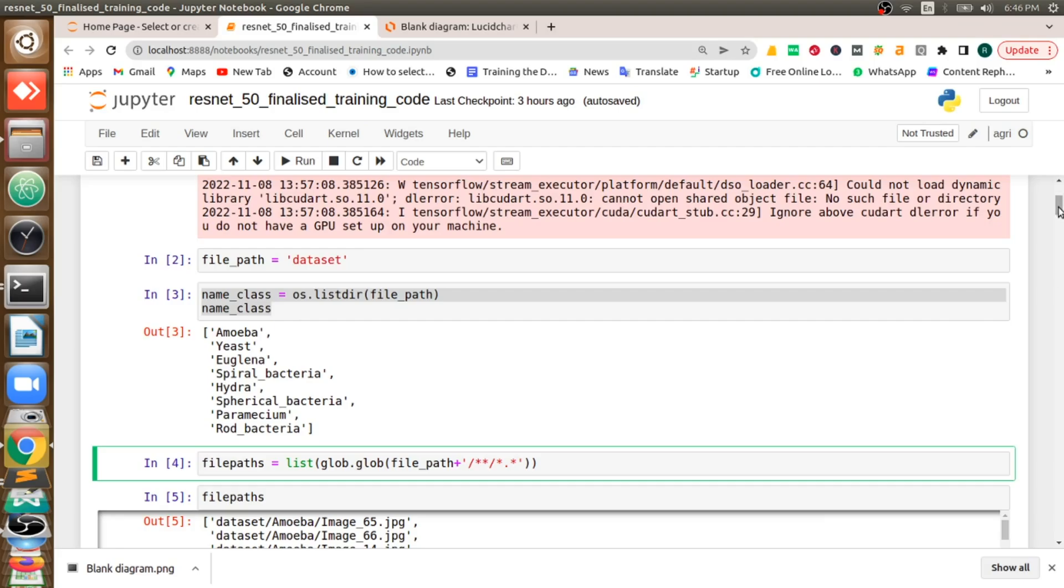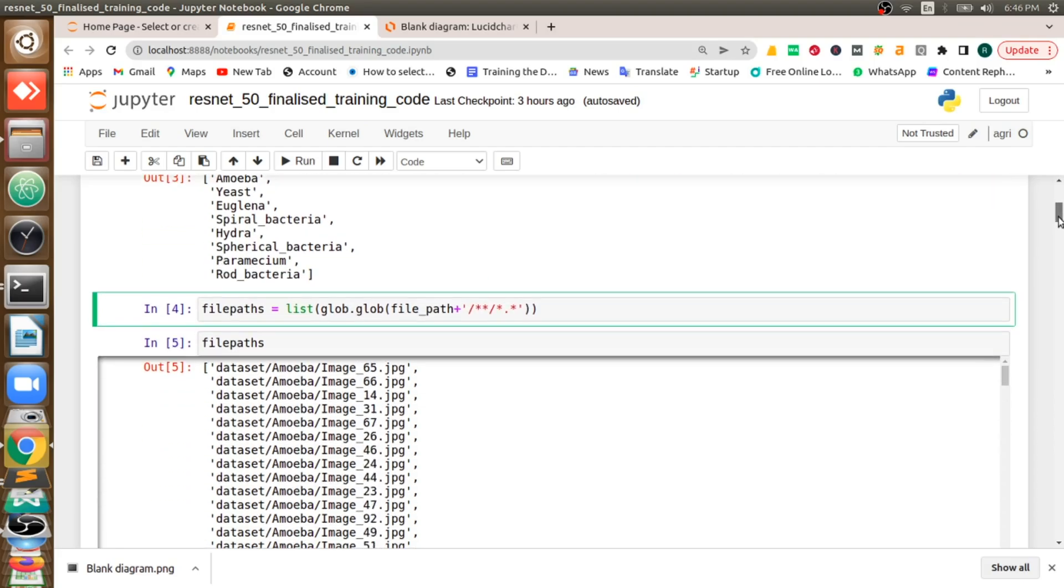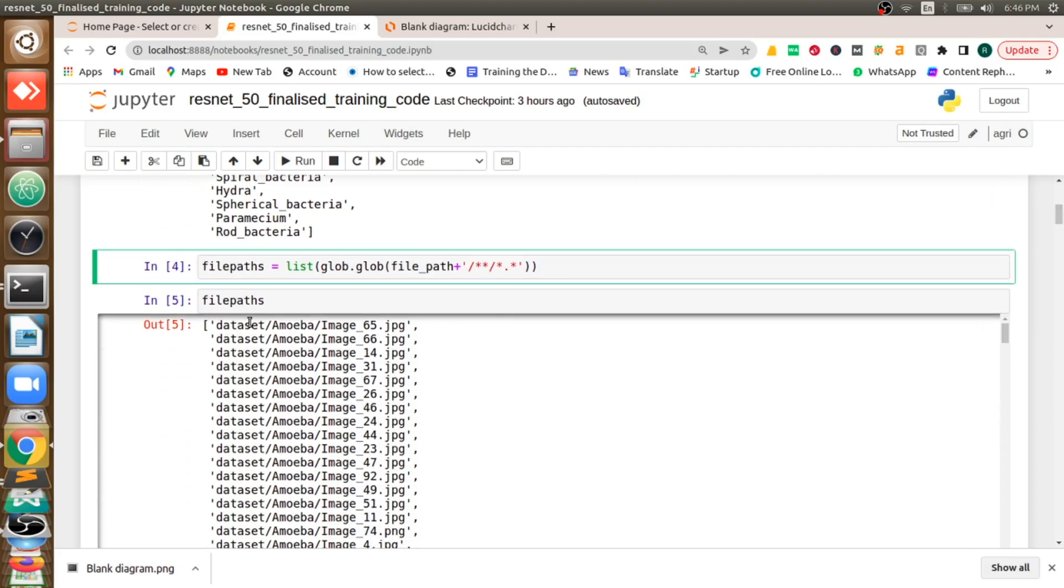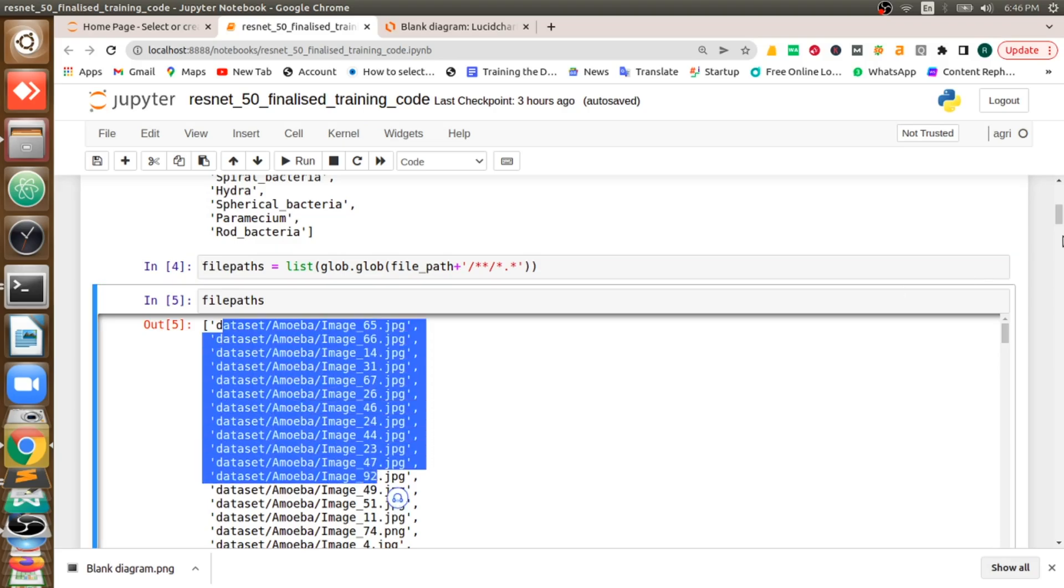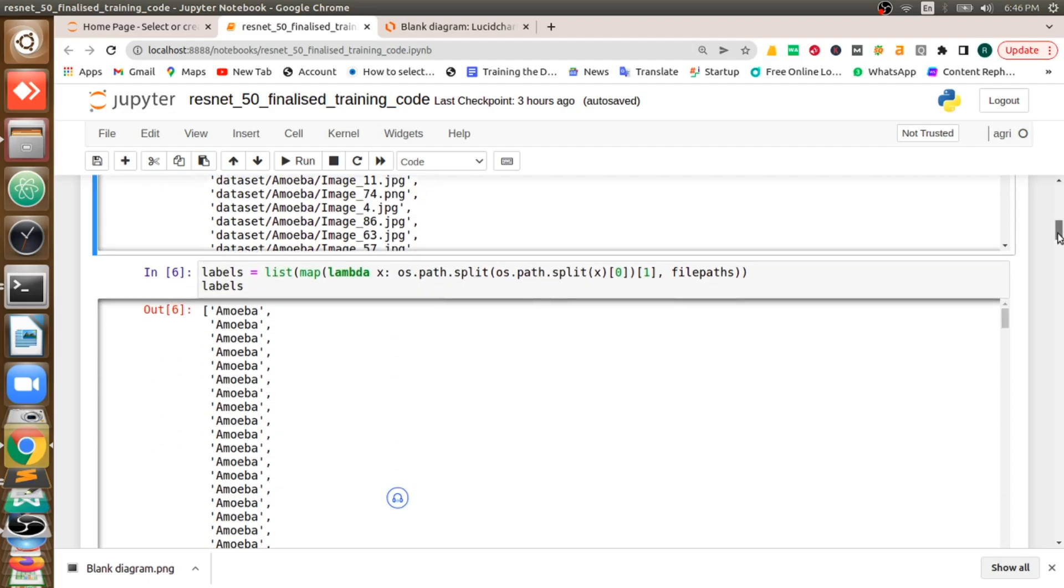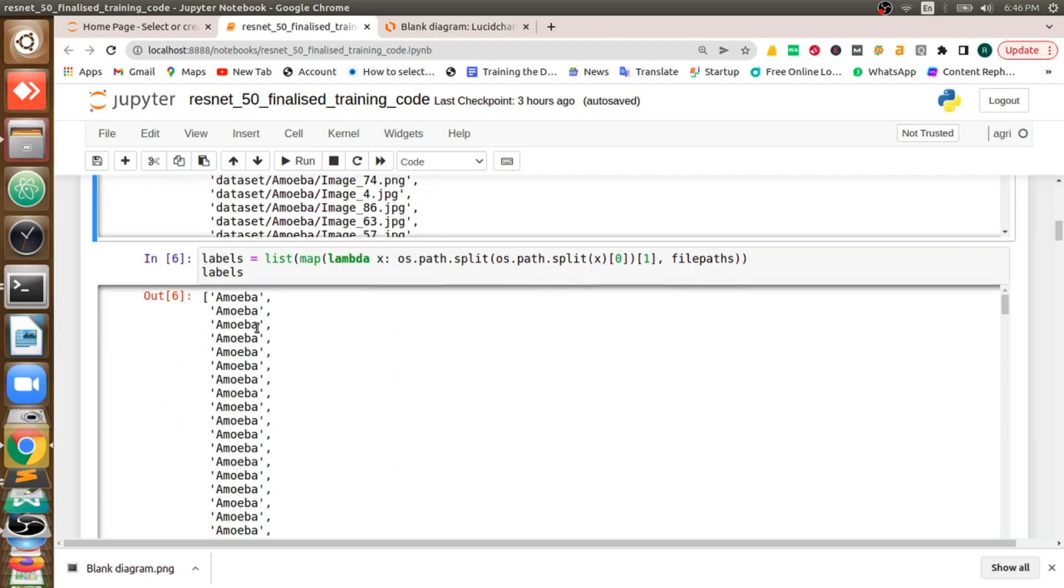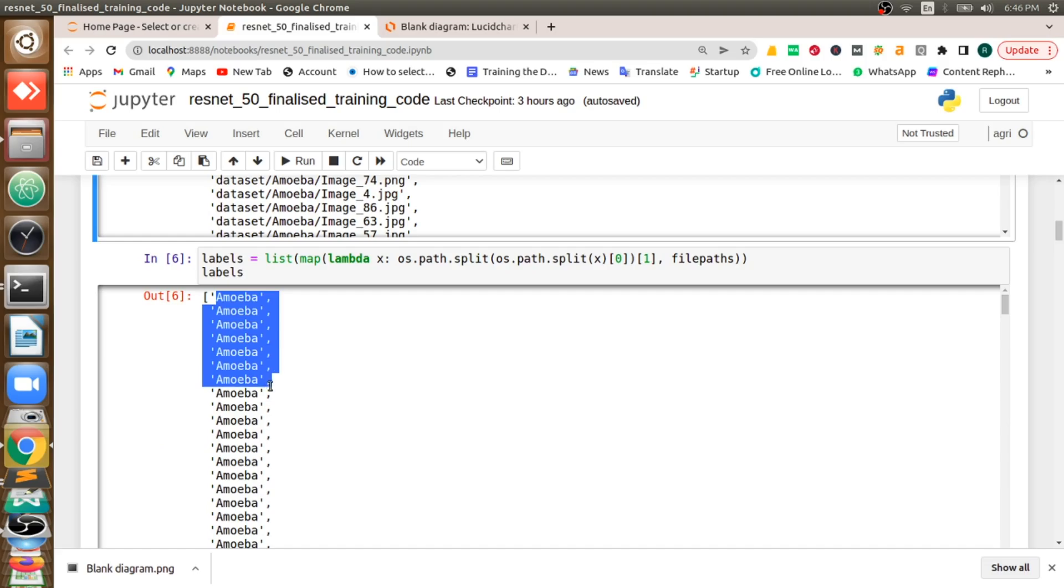Now I will access both input and output. In my case, what are the input? All the image paths, complete image paths are my input. And all their labels, particular image and its label which class it belongs to, is my output.